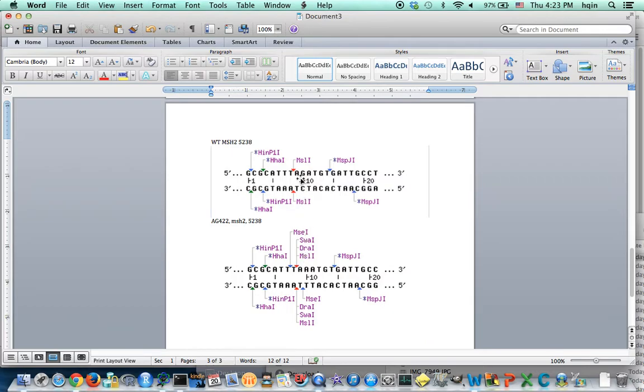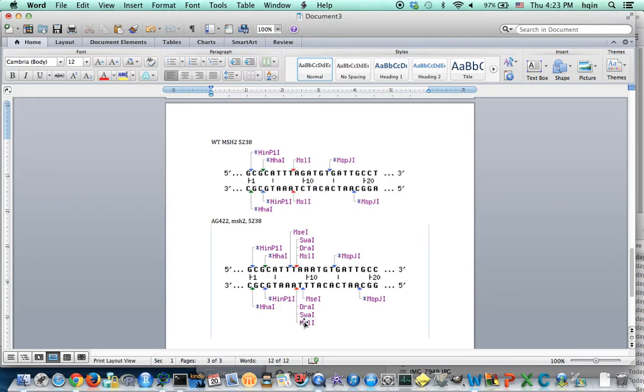And that's wild type. So MSL1, this is a bad enzyme because it cuts both wild type here and also the mutant here.